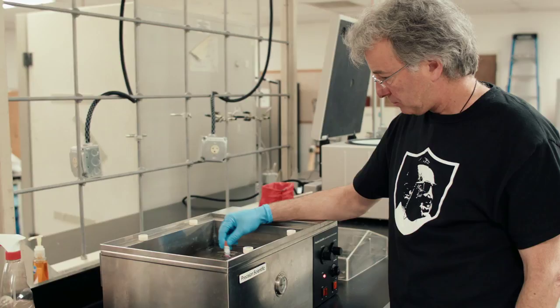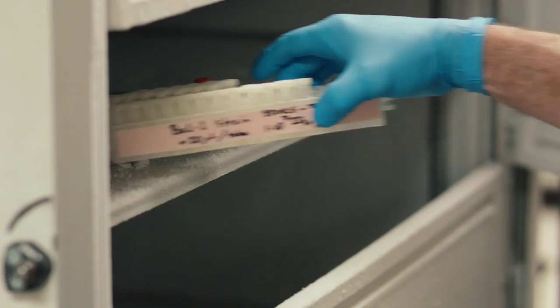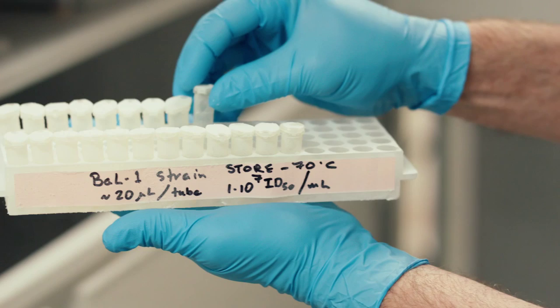So we take that, and then we aliquot it into these tiny tubes. You can see just a little bit of virus in the bottom of each of these tubes. It doesn't show up very well, because it's light colored.